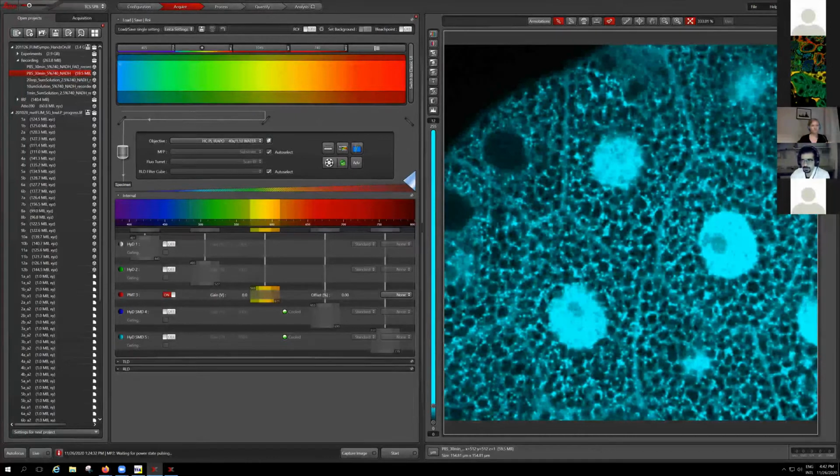That's in principle. But there has been publication and discussion where they measured and found that when you fix, for example, the tissue, they don't find much of a difference. In principle, yes, there are changes, but they might not be huge. I have not measured it so far, but I know there is this discussion in the community about whether it really changes or not.